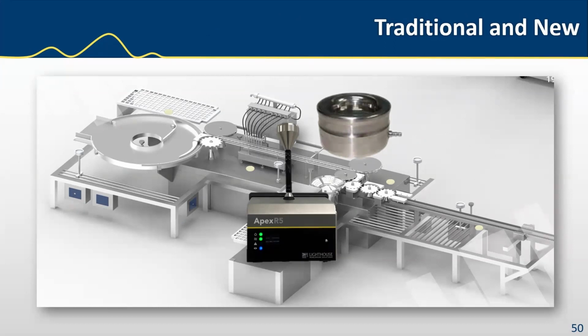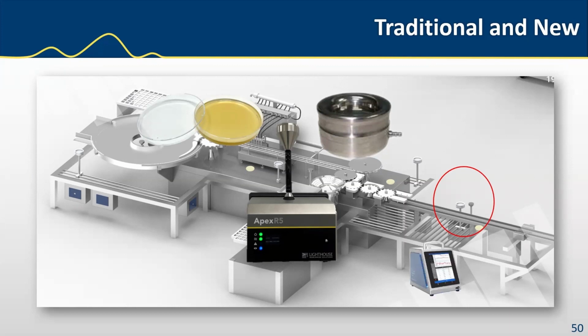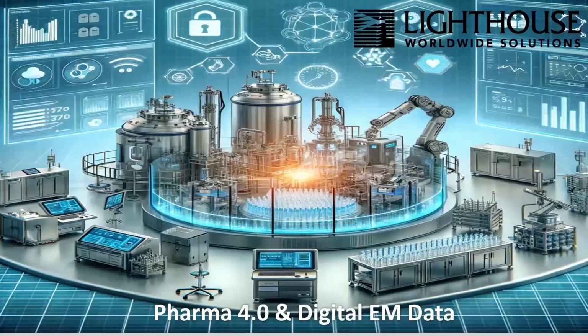And if you do have an event along the way, well, then you can say over this area here you have a high count. Then you can implement your troubleshooting tool, your biological sampler, to see if it's got a trend of biological events that will tell you you've got some issue in that area and you need to find the root cause.